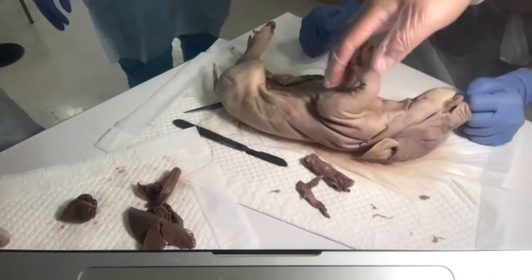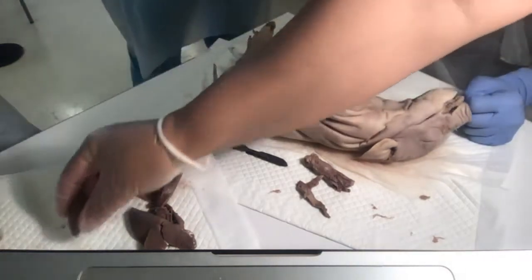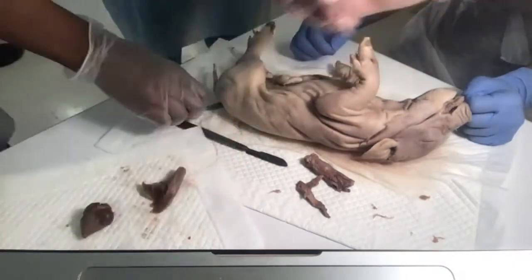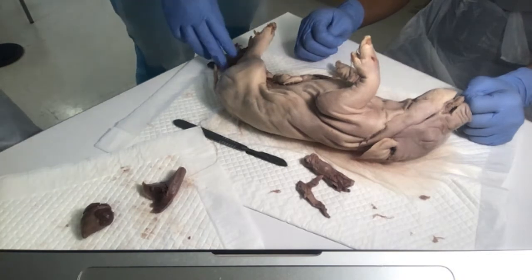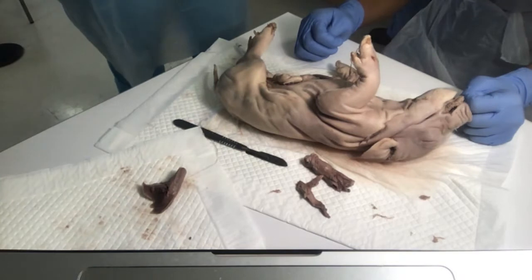So when we look at this, we already know the heart, so we don't have to go through it. But since you're there, can you take the scissors and open it up so we can look at it? And then you, I could give you another scissors. And can you cut open one of these lungs? Open it up or use a scalpel.